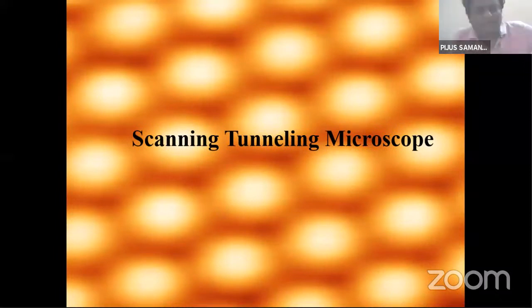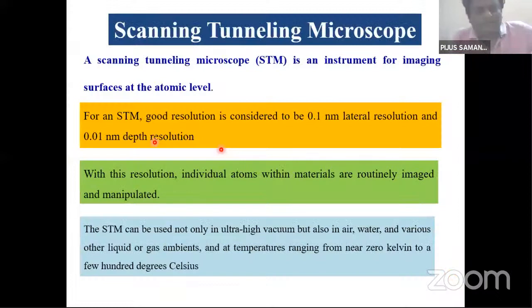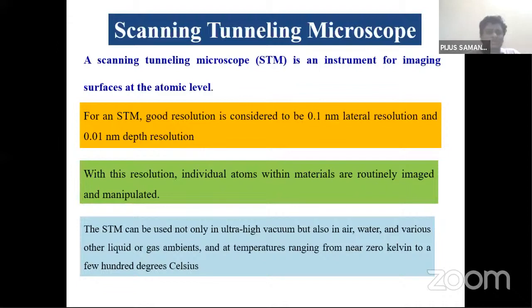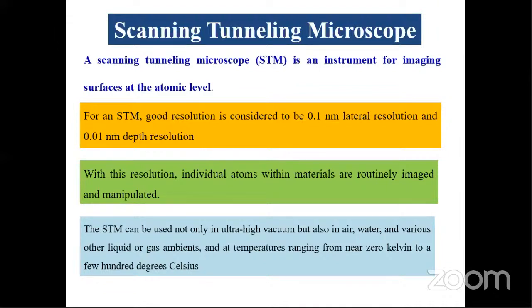We can only image the surface of a material, and it has a very high resolution. The resolution limit is 0.1 nanometer lateral resolution, and depth resolution is also 0.01 nanometer. So we have practically scaled down to atomic level resolution. That is the beauty of this microscope, that it offers us a very high resolution.